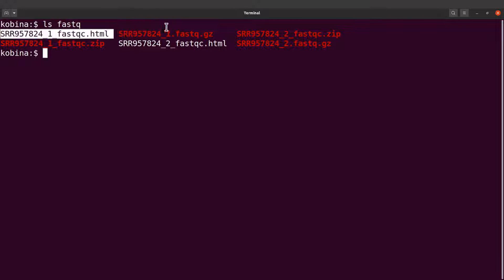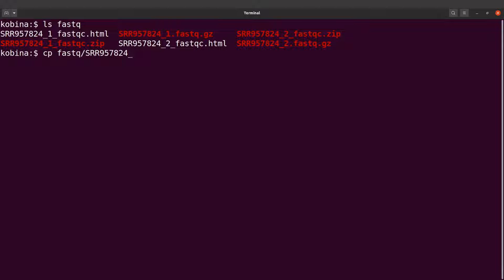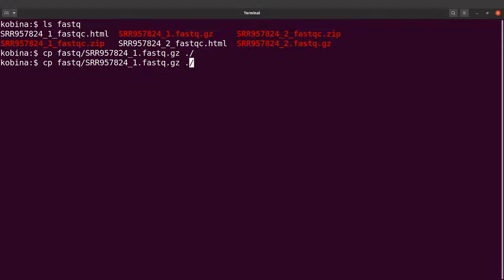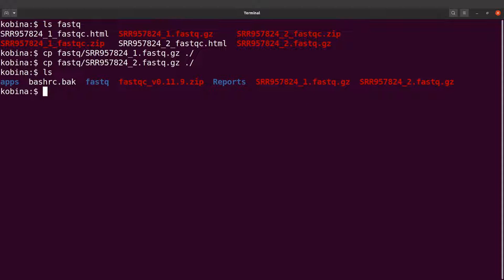Let's make a copy of this into our current directory: cp fastqc slash SRR one dot fastq dot gz. Let me copy the other one too, that's with two. I'll copy them again here. So if I want to run FastQC on just a single file, I just need to specify the file name. I can say fastqc and then specify the file name.